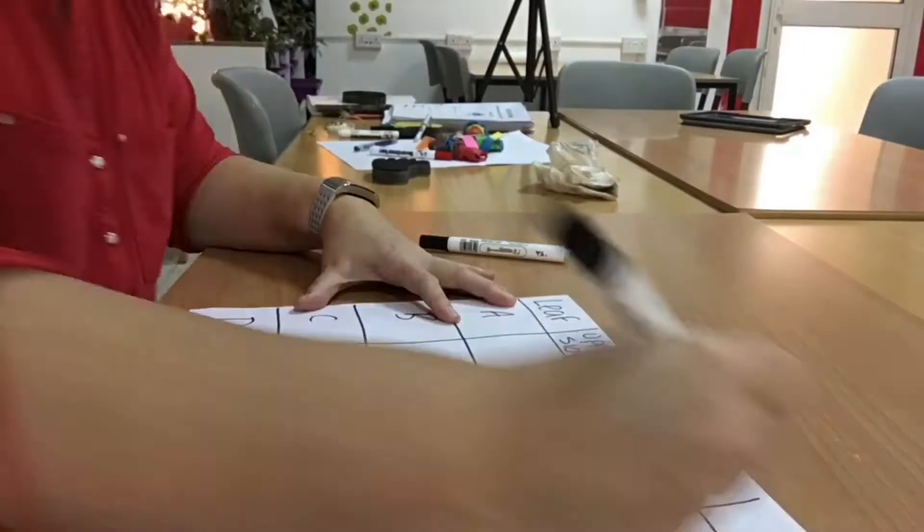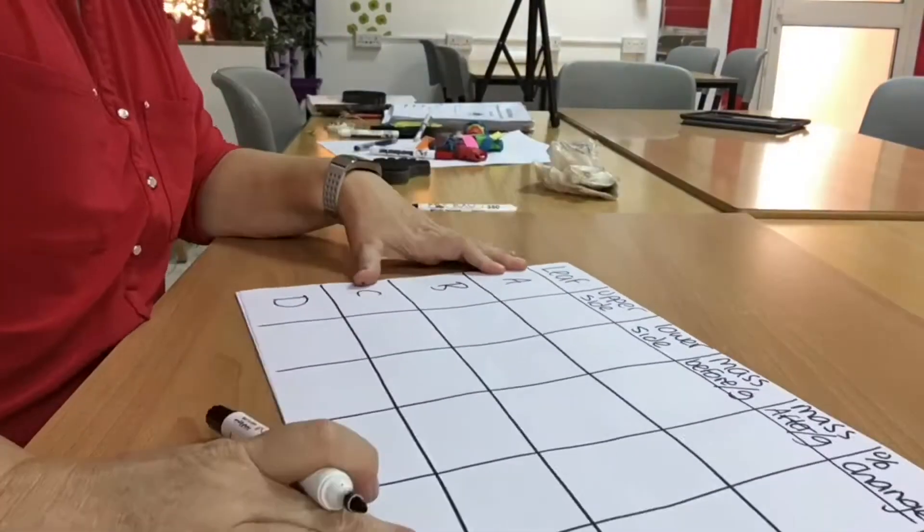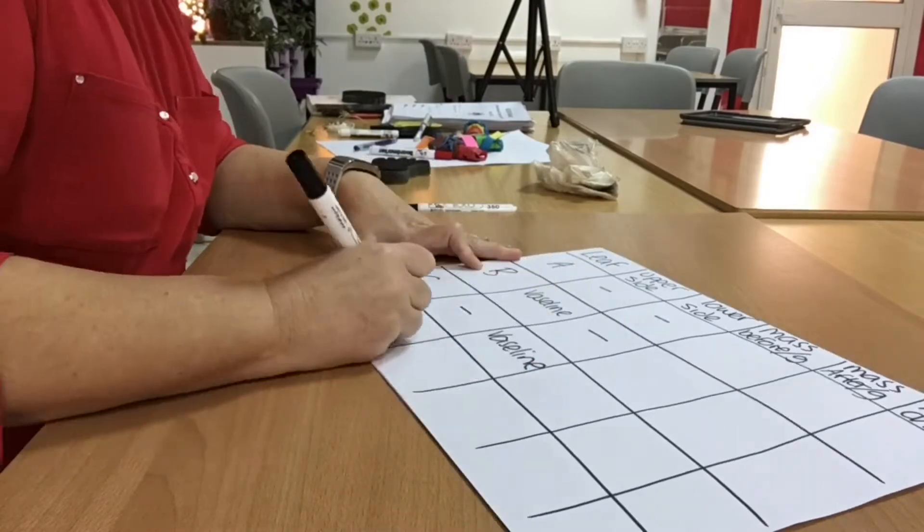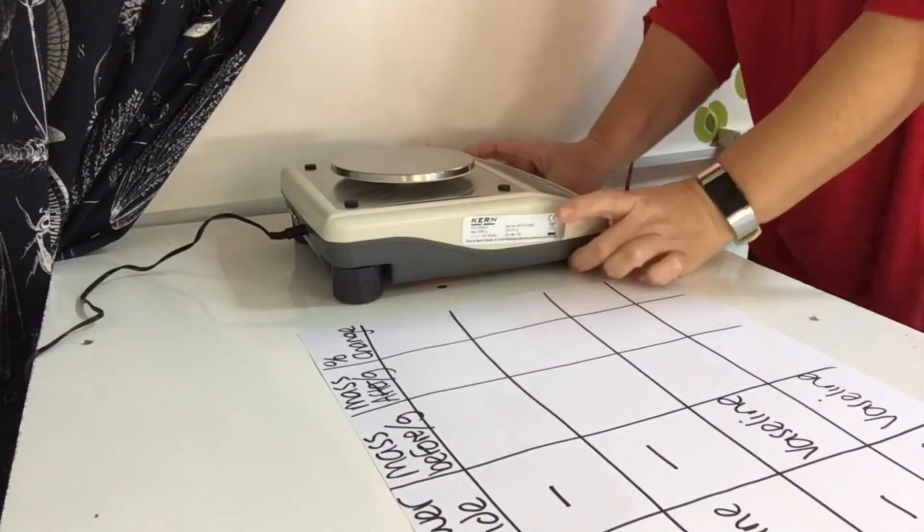Here's the table I made earlier. I'm recording which side I'm putting Vaseline on, then I'm going to weigh them. It's important that I keep my leaves in order and make sure I know which leaf is which.